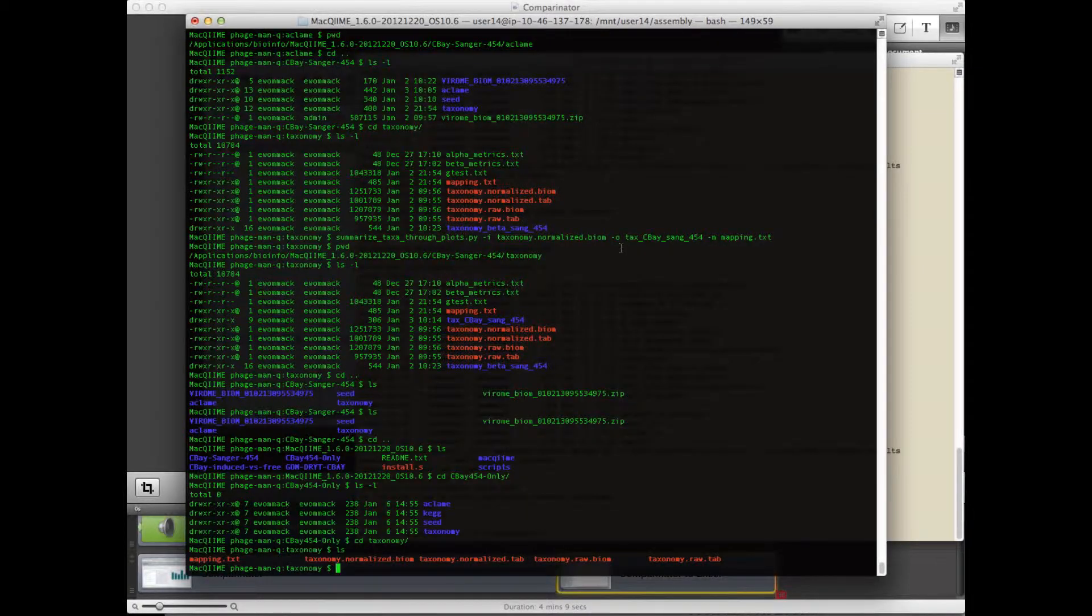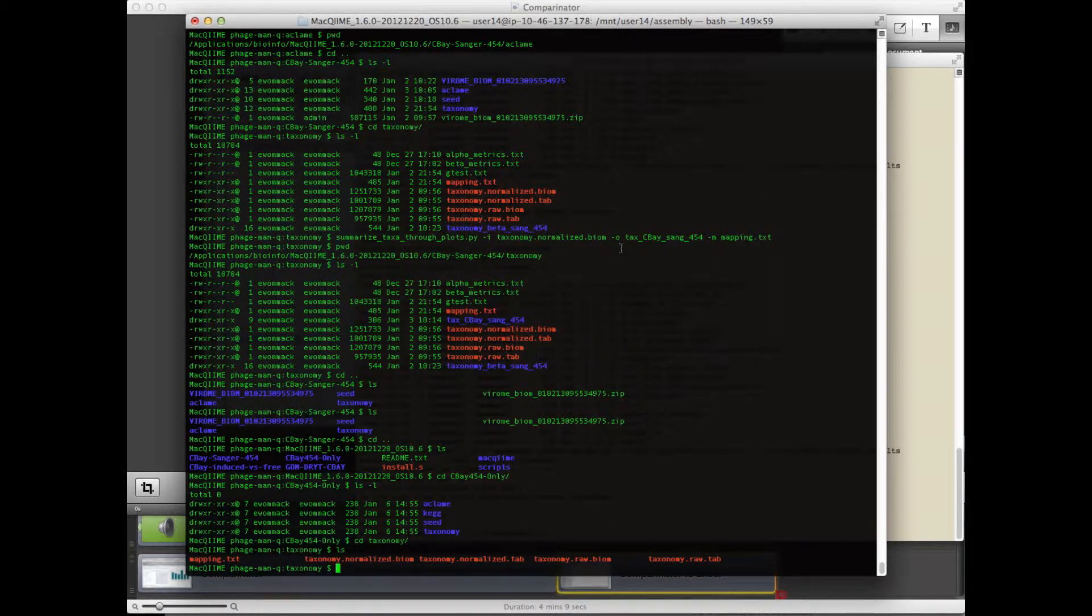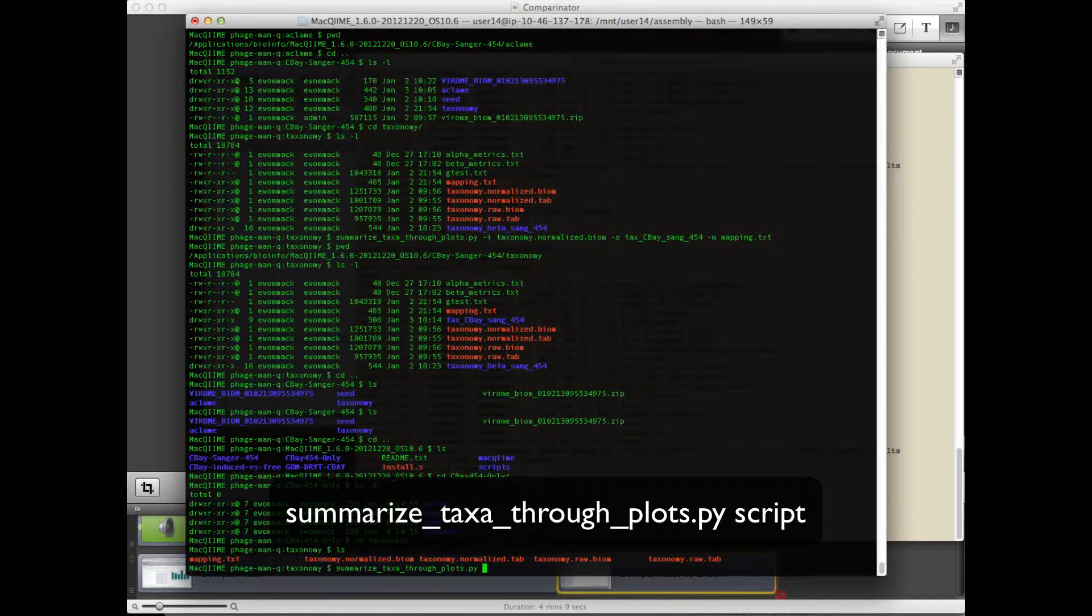Here I demonstrate the use of MacChime, which is the Mac version of the CHIME package, to analyze one of the biome files that we just downloaded. So I'm going to run the summarize taxa through plots script. And that's what I show here.